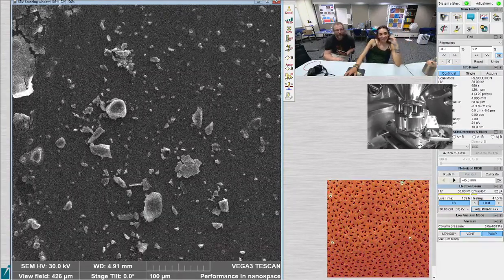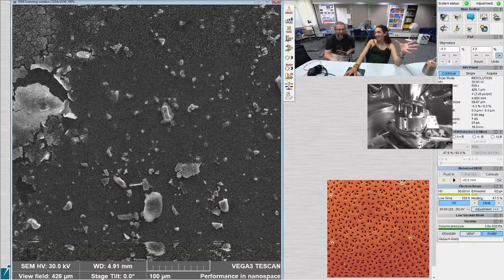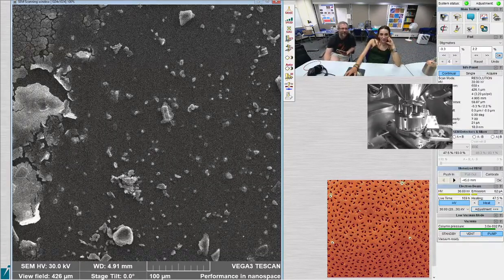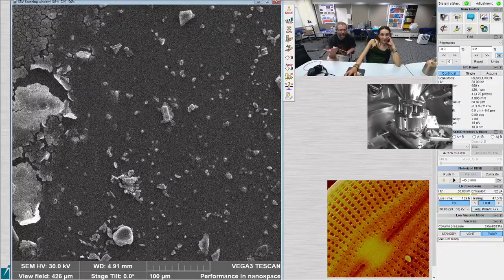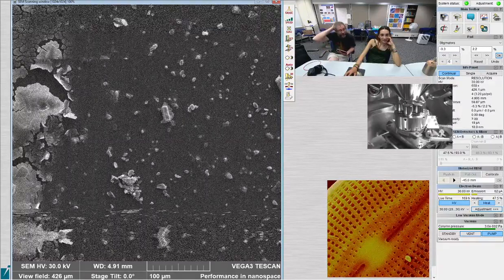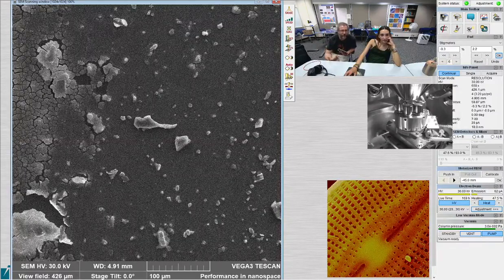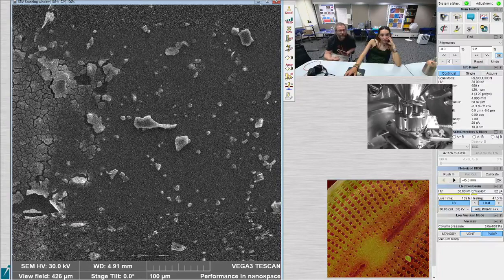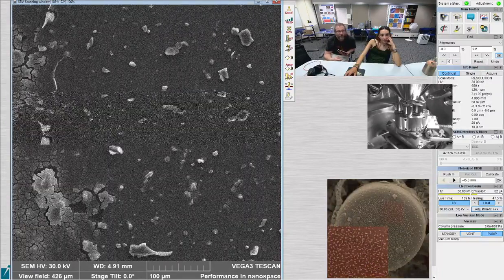For the most part, yes, because the stub is round, and it's kind of hard to get all the coordinates. But I usually try to get the scale bar to sit right at the same size, like right when it switches between 100 and 200 or 150, so the scale bar at the bottom will tell us the scale in microns, or micrometers.